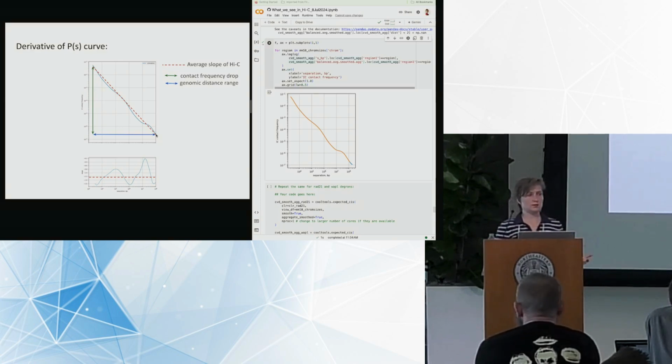And that will be informative for us about the properties of general folding of DNA in the nucleus. And again, you can do quality control if it's too flat. If the slope is not that large, we can be not sure that our Hi-C experiments ran well, and there might be some trouble with ligation, for example. It might also be the sign of different biology happening within our cells.